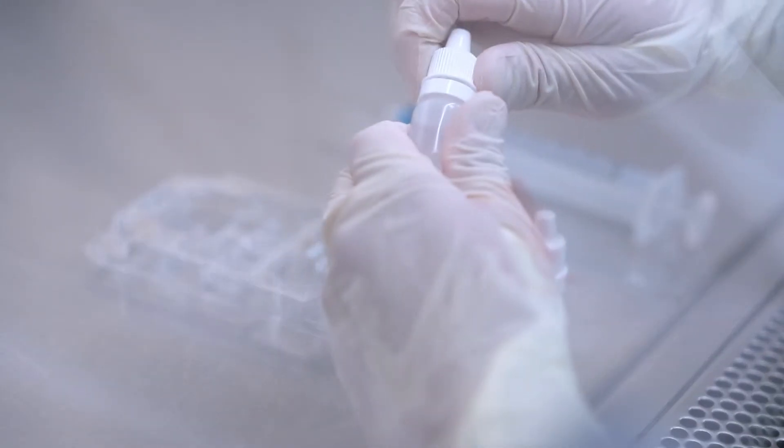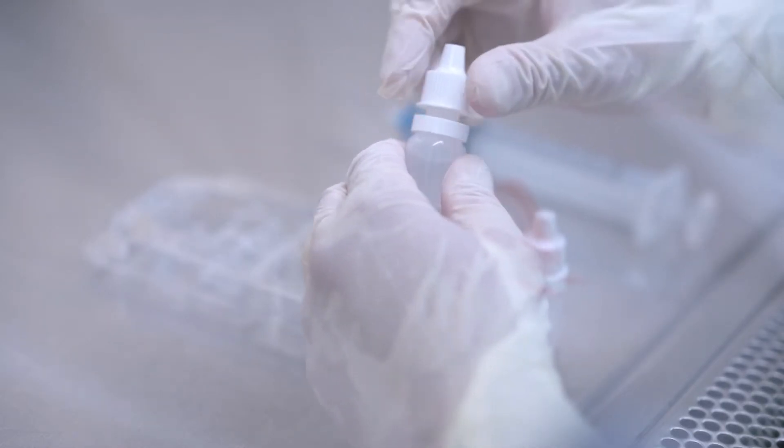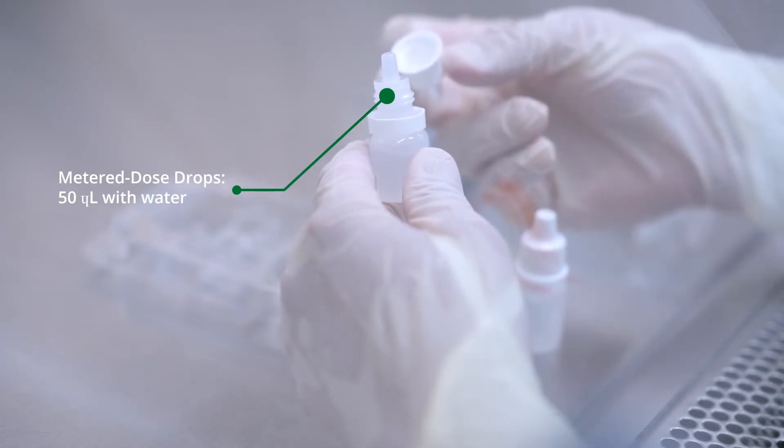The tip is automatically locked in when screwed on tight and dispenses a metered dose drop of 50 microliters with water.